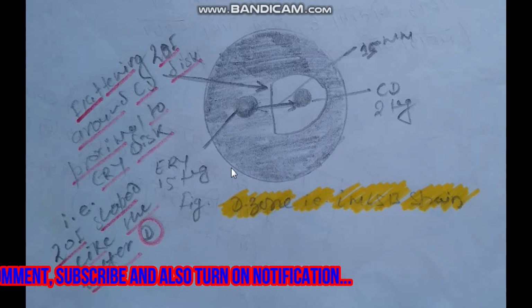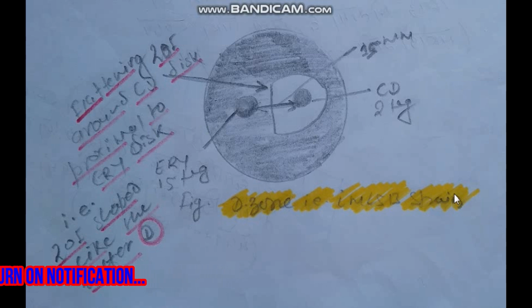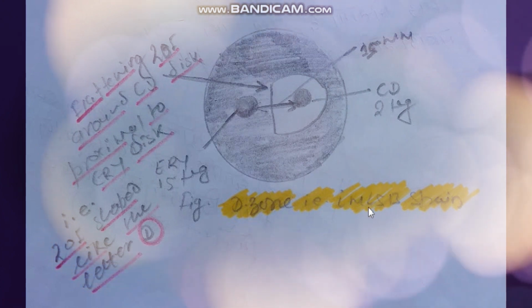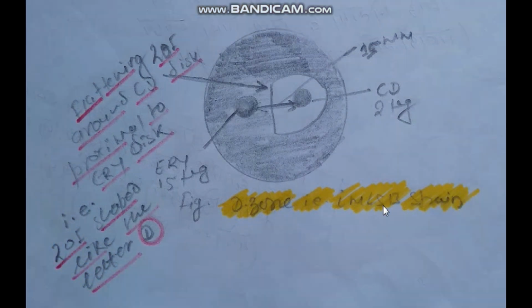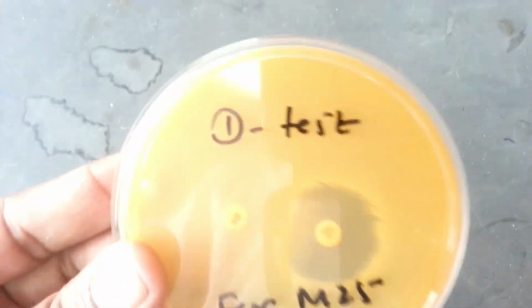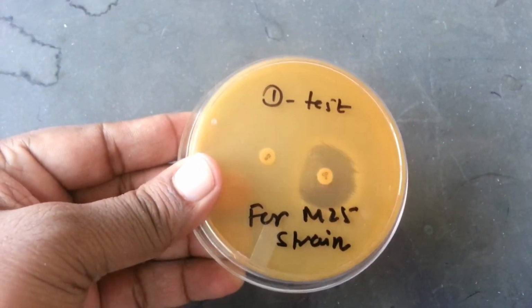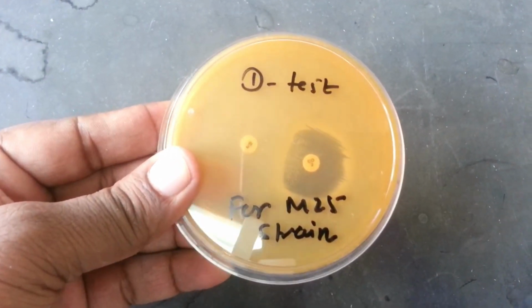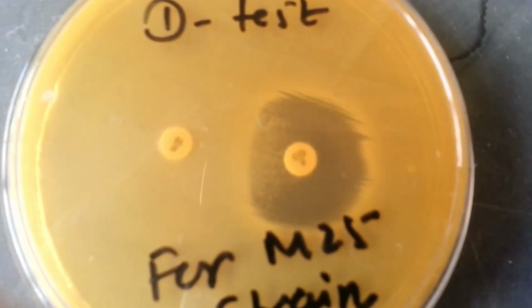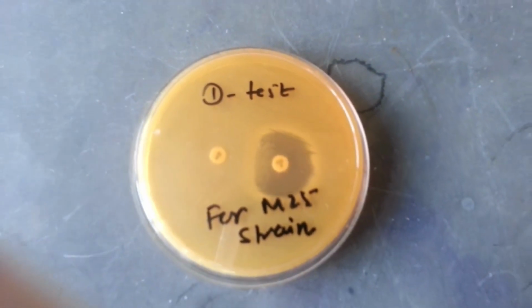For this strain, lincosamide, macrolide, and streptogramin drugs are considered resistant. That's why it is important in clinical practice. So this is the D-zone test positive and the organism is an iMLSB strain.